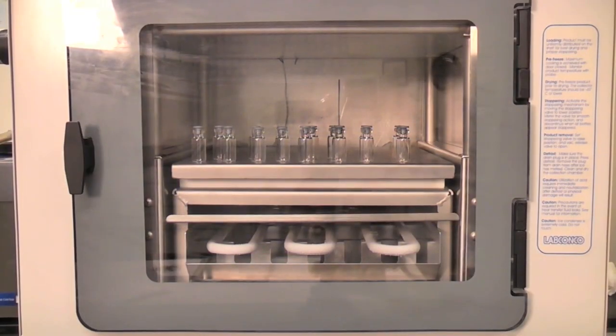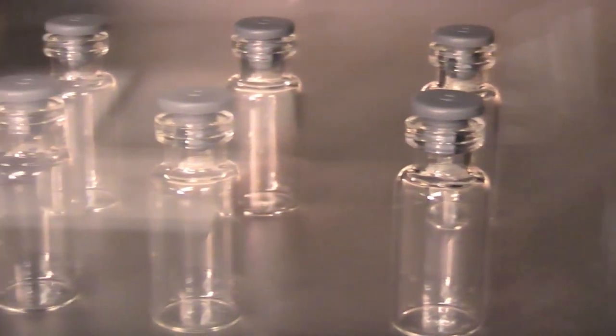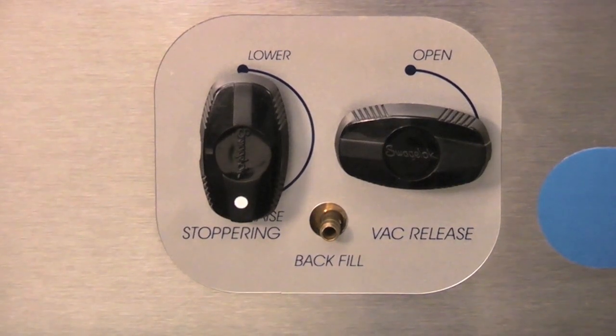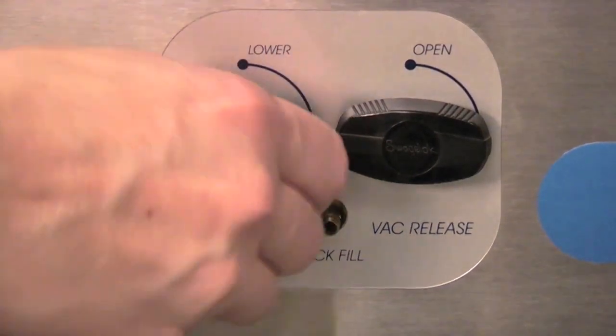After the freeze-dry process is complete, the samples can be stoppered under vacuum or nitrogen. To stopper under vacuum, simply move the stoppering control toward the lower position.